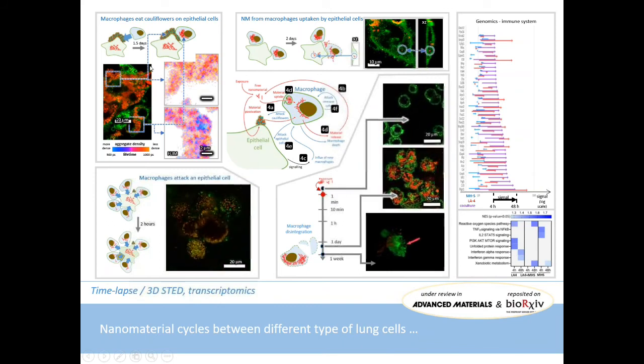It's interesting that they sense these bio-nano composites on the surface of the epithelial cell. They can uptake parts of these composites and they degrade them, because we can see from lifetime microscopy that the packing of the material after they eat those structures is different than it was in the epithelial cells.